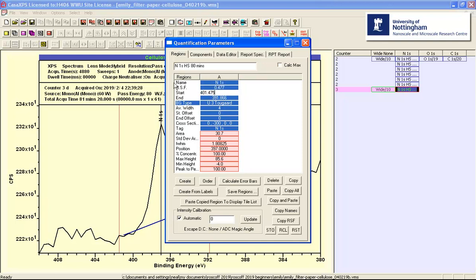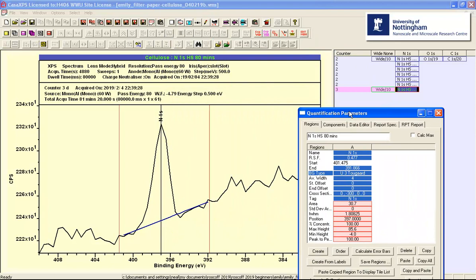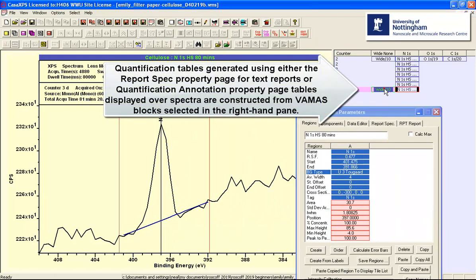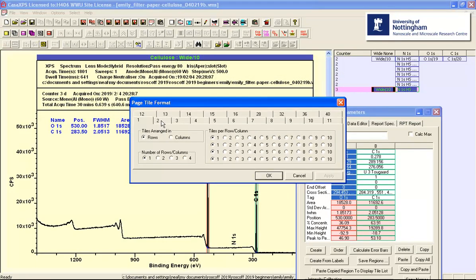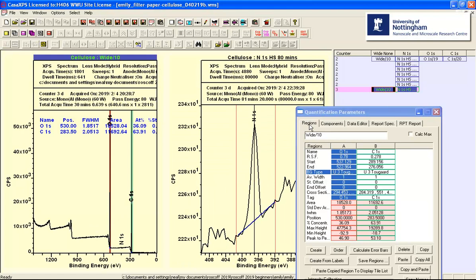So I have nitrogen here. I need to make sure that I use the same relative sensitivity factor. So we've got the survey. So we'll display both of these in tiles. So we've got the survey with the oxygen and the carbon. And then we've got a narrow scan that was measured for longer.